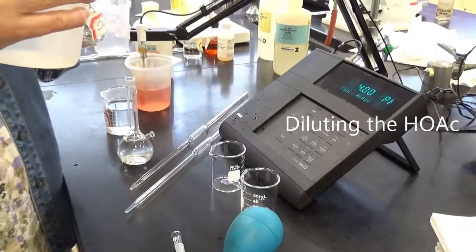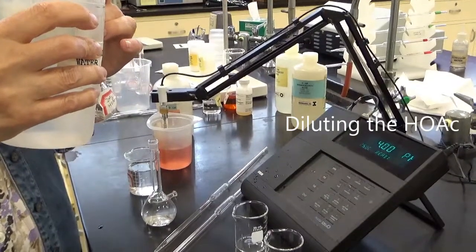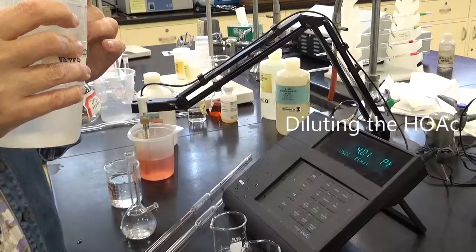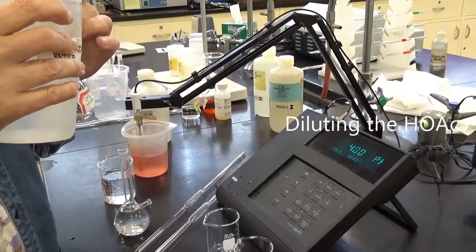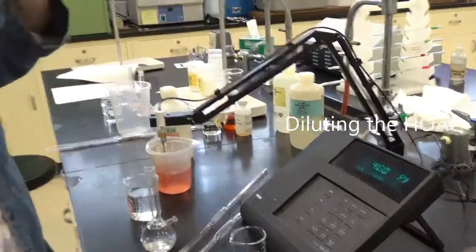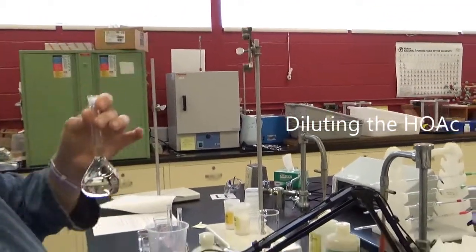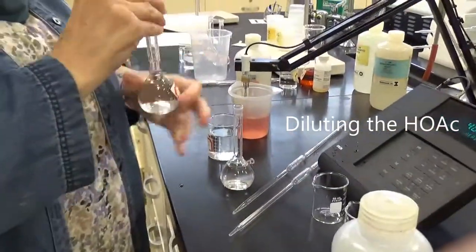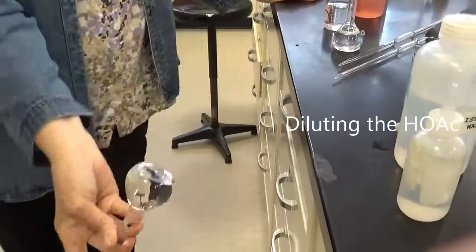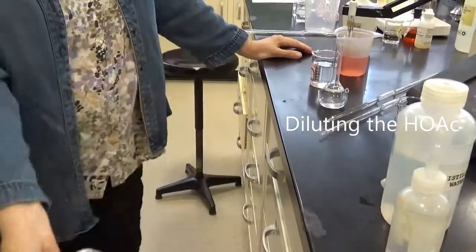We call it, like I said, a 10-fold dilution, factor of 10 dilution. 5 milliliters diluted to 50. Get that to the mark. Good. 1, 2, 3, 4, 5, 6, 7, 8, 9, and 10.